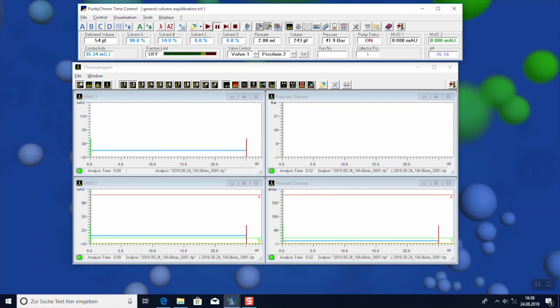All values you put in at first are being logged and can be later on found in the protocol viewer in the reconstruction file.